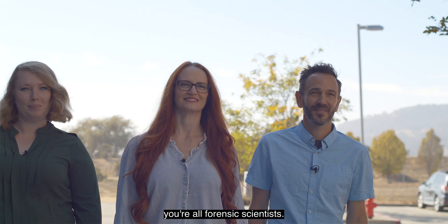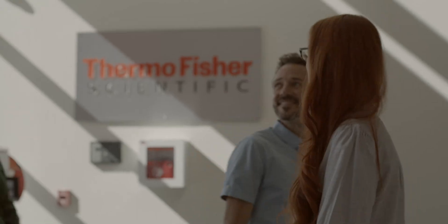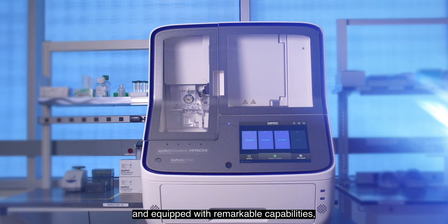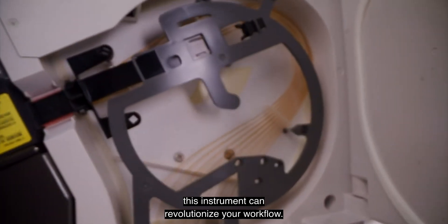Just to confirm, you're all forensic scientists and none of you are paid actors. Not an actor. Sleek, modern, and equipped with remarkable capabilities, this instrument can revolutionize your workflow.